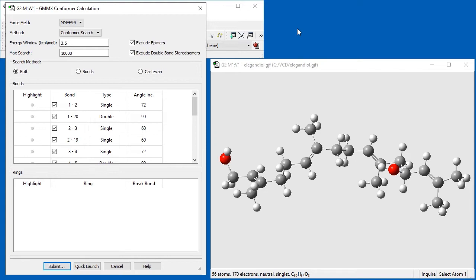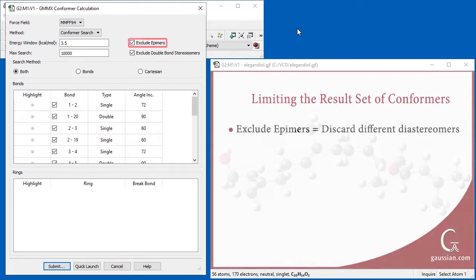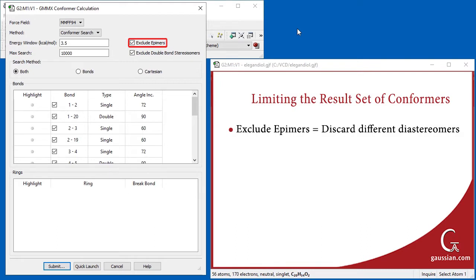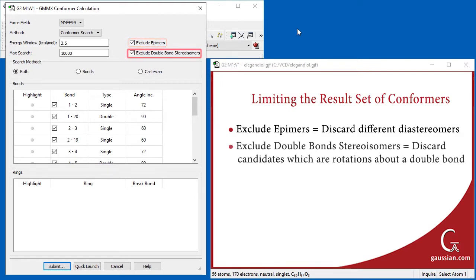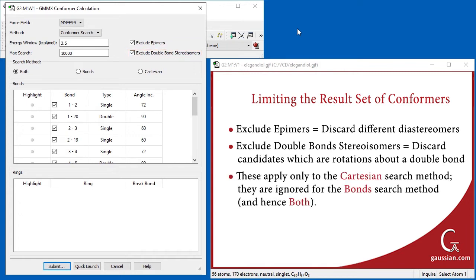We also keep Exclude epimers and Exclude double bond stereoisomers checked. Exclude epimers says to discard candidate structures which are a different diastereomer than the current structure. Exclude double bond stereoisomers says to discard ones that correspond to bond rotations about double bonds. Note that these two items apply only to the Cartesian search method, which we consider next.